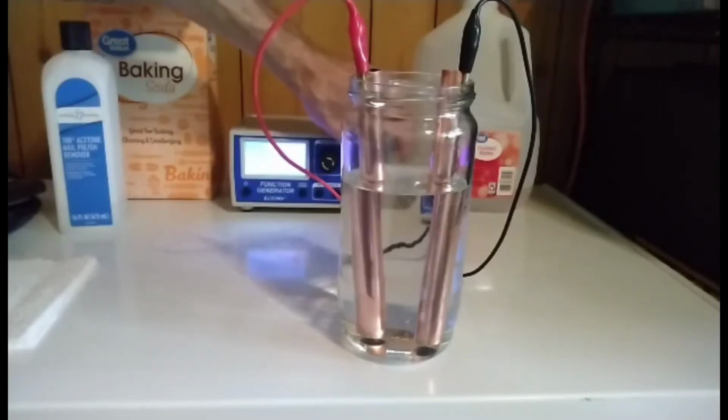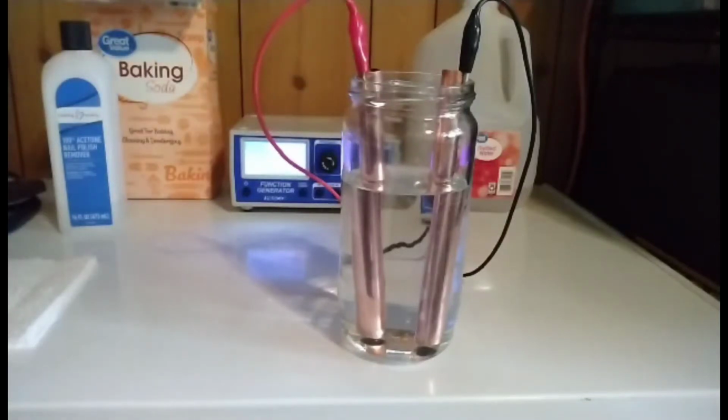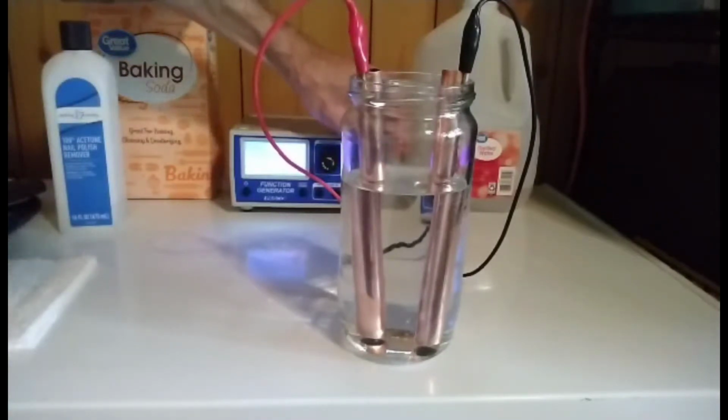And you don't want this current to be too large, otherwise this will generate some undesired reactions that will produce some impurities that we don't want. So here I'm going to use maybe 30 milliamps. So simply increase the voltage until you observe the desired current.